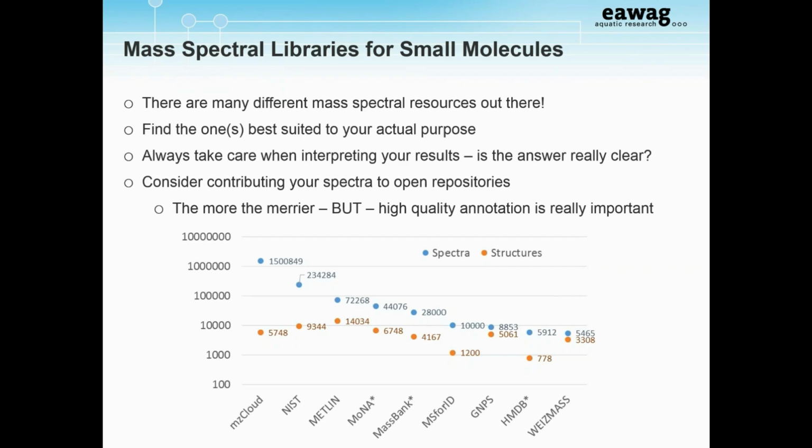Another GCMS related one: with high resolution GCMS and Orbitrap GCMS upcoming, there's still no publicly available high resolution EI libraries yet. So for unknown compound identification, is HR GCMS too optimistic at the moment? I know a lot of people who are using these in combination, because you can still use your EI-MS library to get the low resolution information, and without having actually seen GC-Orbitrap spectra, which I would love to see.